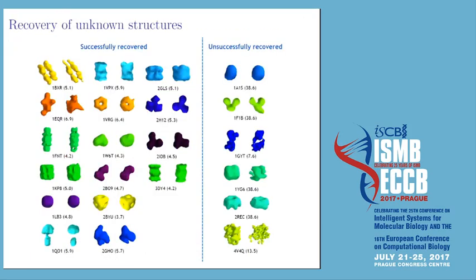To systematically test this idea, we have performed a leave one out test, and we are able to recover 16 of these macromolecular complex structures.